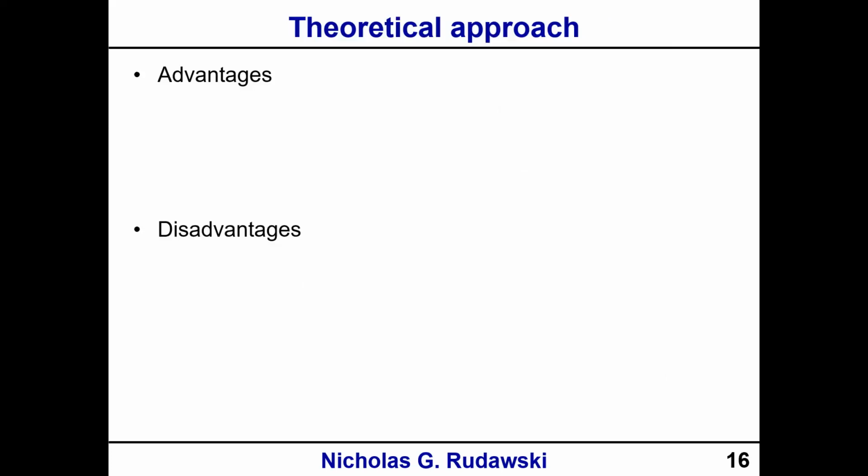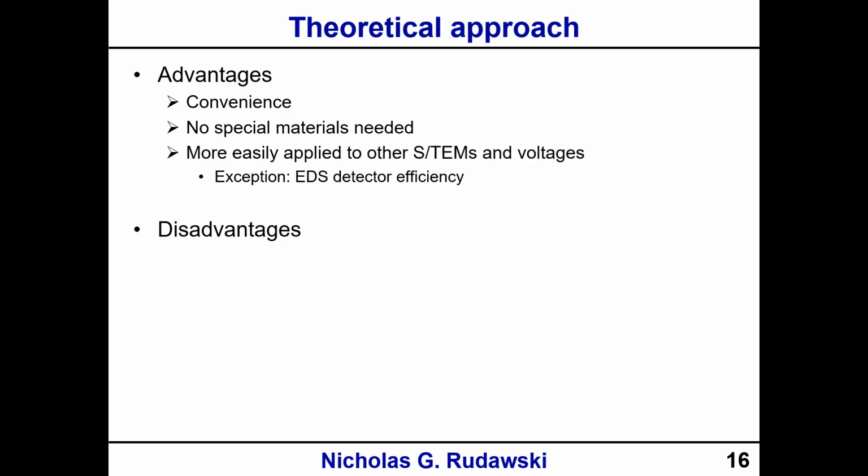So the theoretical approach has advantages, right? It's more convenient, okay? It doesn't involve making lamellas. It doesn't involve collecting a lot of data, okay? So we have convenience on our side. We don't need special materials, standards, any of this.